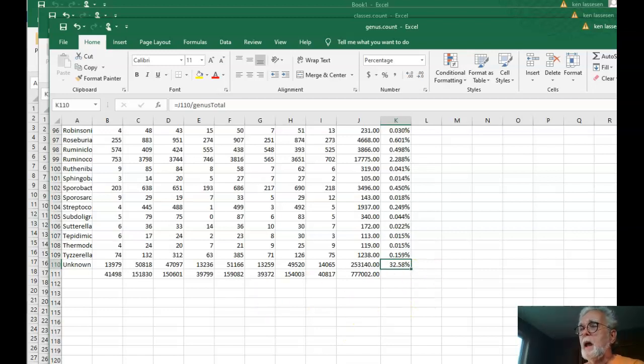Okay, at this point in time, I think I'm done. I've done a complete walkthrough, including showing the data in Excel. Go explore, play with it. It should be good. Have fun.